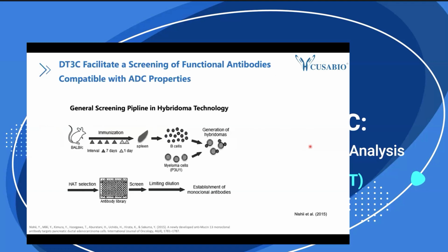So not only in a very common scenario, here I put another scenario showing how the DT3C can facilitate the screening of functional antibodies that are compatible with the ADC property. The whole idea about DT3C is to facilitate ADC discovery. So we want to highlight the wider application of this with the hybridoma technology.